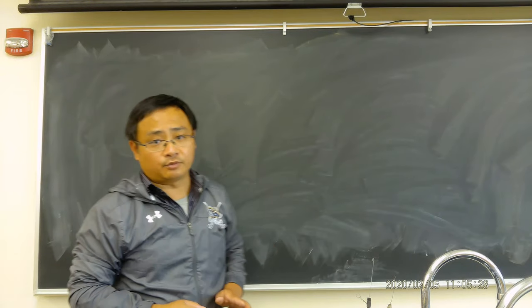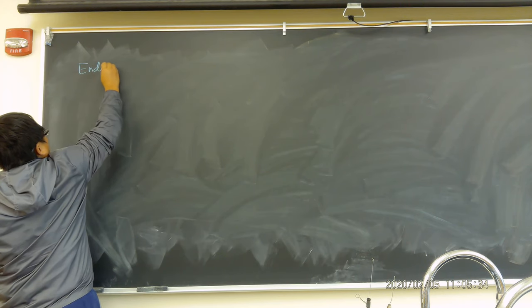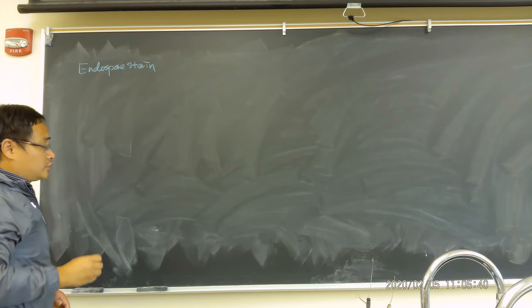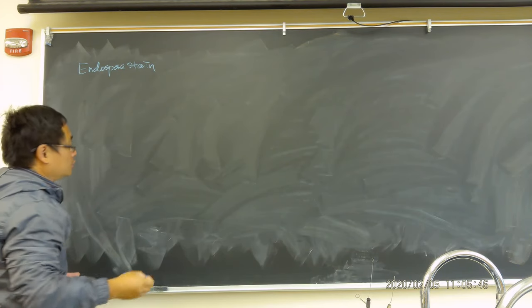The second video module will talk about the endospore stain. We talked about it in the lecture, but we'll still do a little bit of introduction here. So what is an endospore and how do we stain it?